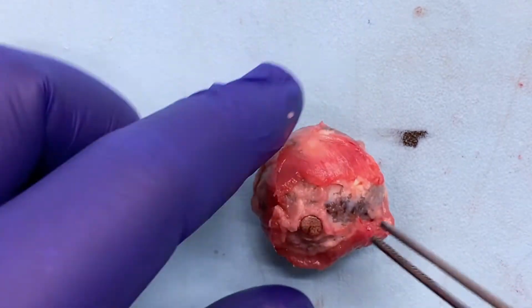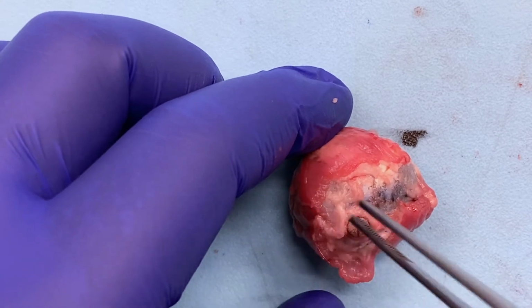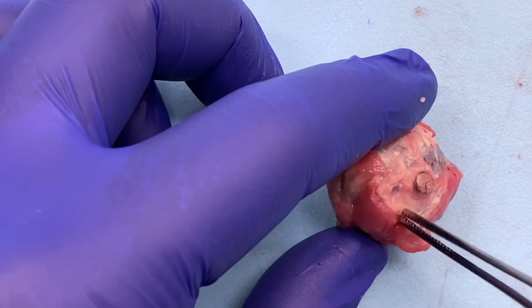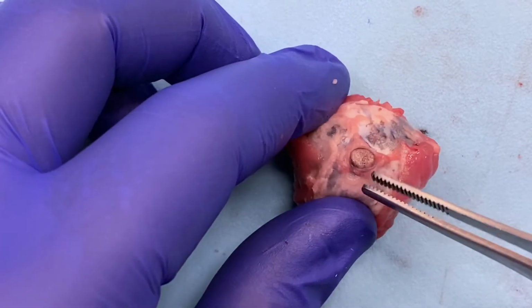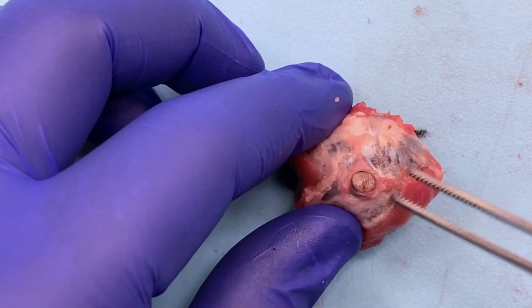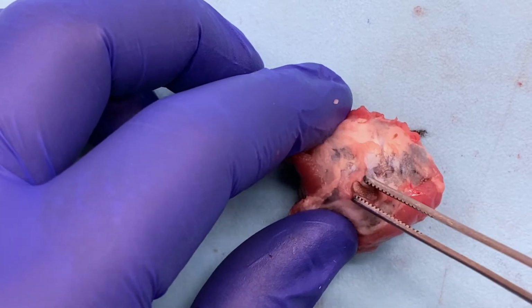We already talked about the musculature. So we have superior and inferior rectus, medial and lateral rectus, and then you should see superior oblique, and this looks like inferior oblique. And then we also have the optic nerve. In these specimens, it's nice and sort of darkened, almost black. And adjacent to that will be that posterior ciliary vessel we looked at.